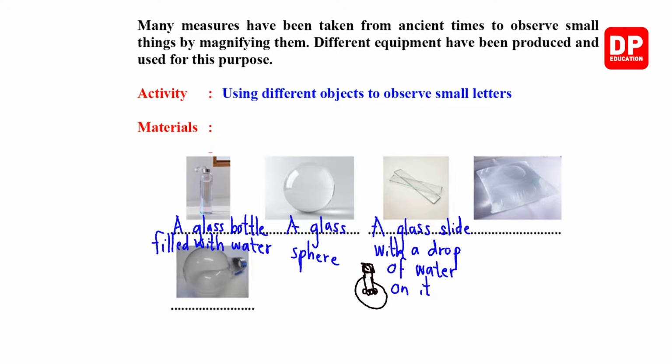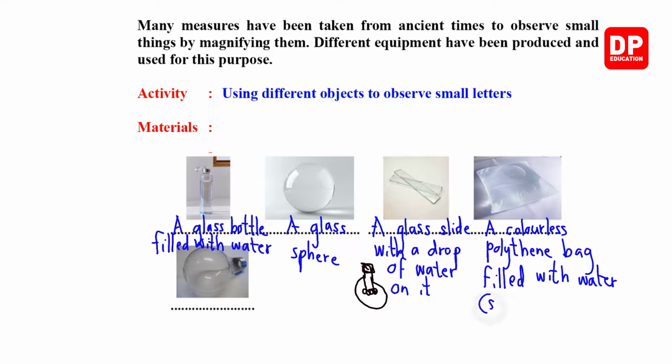Then we need a colorless polythene bag filled with water. It should be sealed.